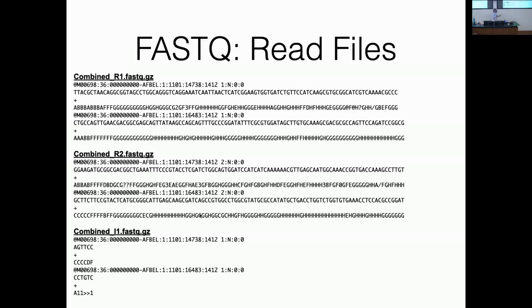Make sense? And then this other stuff is, I think the one here says if this is paired end data, then this is the first read or the forward read. And then the N is super confusing because this will either be an N or a Y.